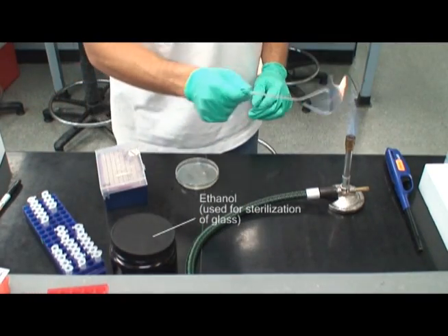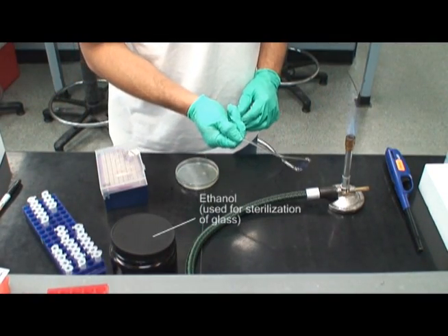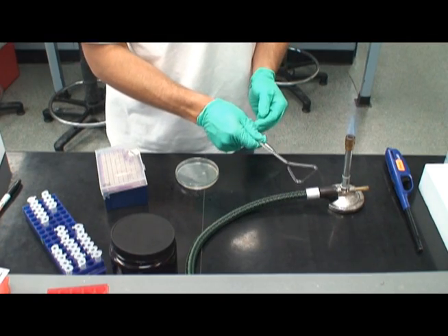A sterilized glass rod is used to spread the plated dilution. If unsure how to safely sterilize or spread bacteria, be sure to review the fire safety video.